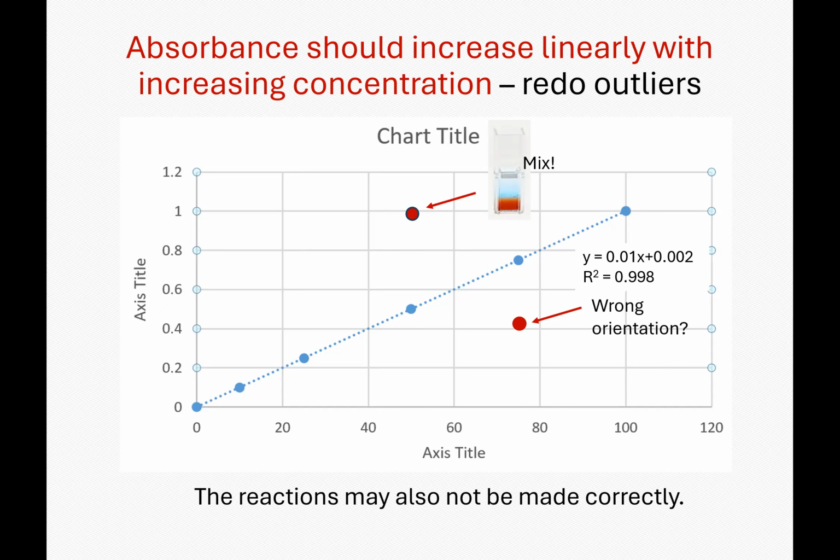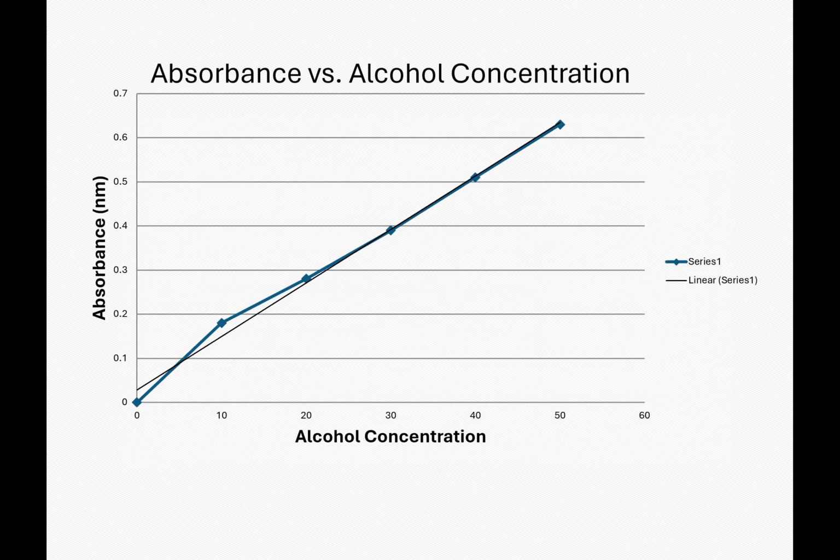It's also possible that your reactions are not made correctly, but it's faster to check orientation and mixing and things like that before making them again, especially once we get to 10 or 15-minute incubations.